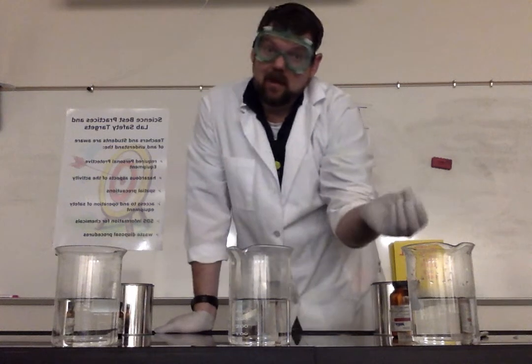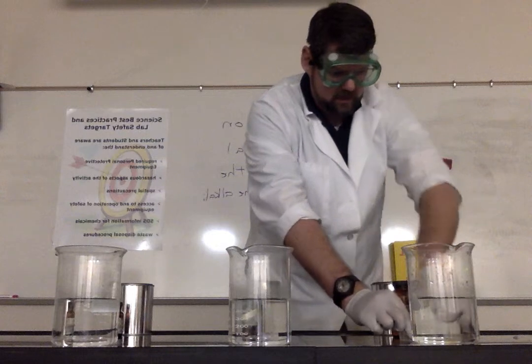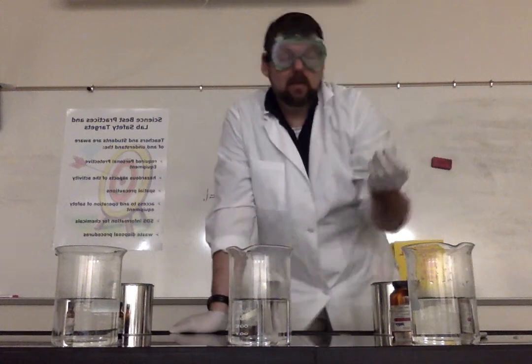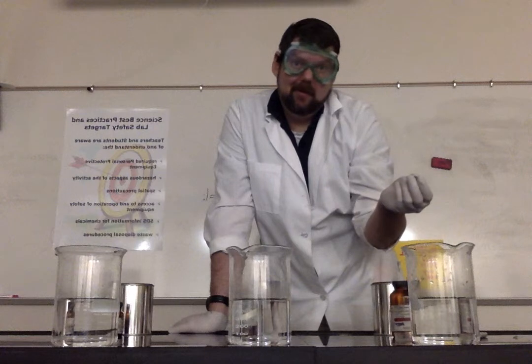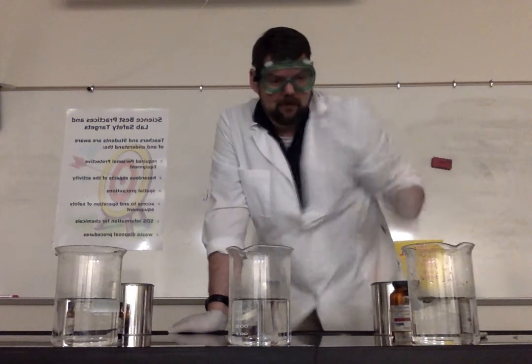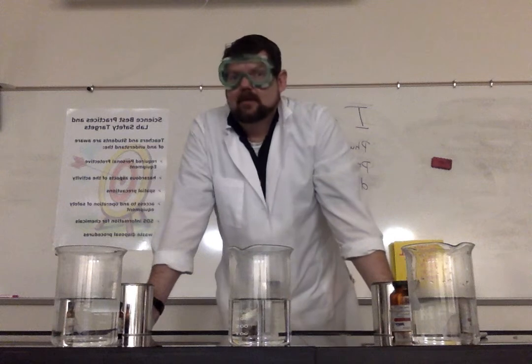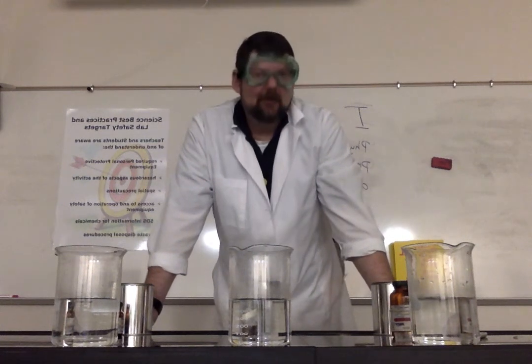Metals normally react in water. Let's go ahead and get a little bit of a smaller piece, and we're going to see what happens. Now this one doesn't have very many electrons, so do you think it's going to be super reactive to water? It's going to be pretty reactive to water, but probably not as exciting as you may think. So let's see. It's almost like an Alka-Seltzer tablet. We have some gas, we got some bubbles, but look, the metal's dancing. That's pretty cool.